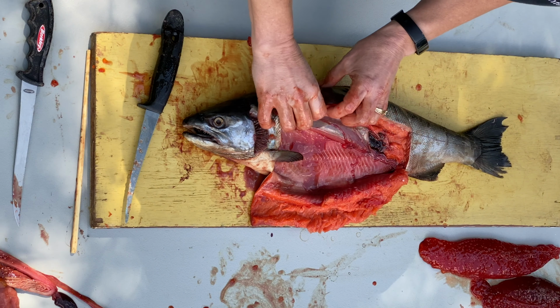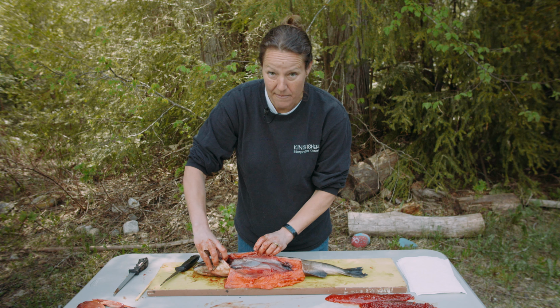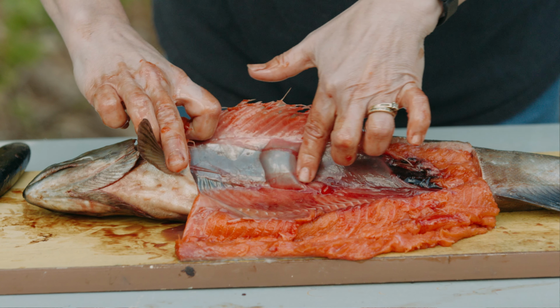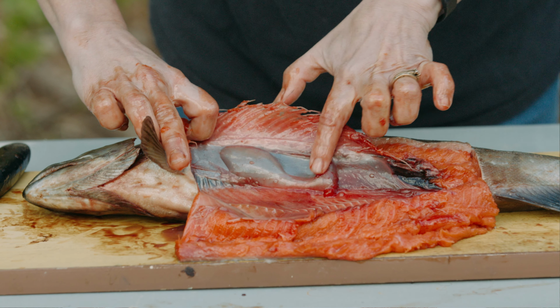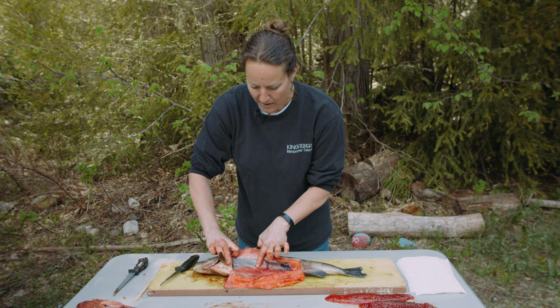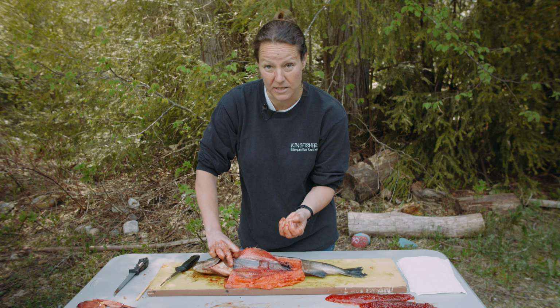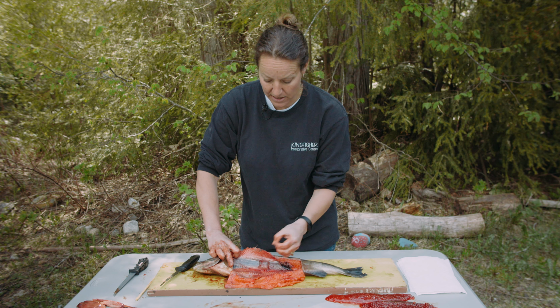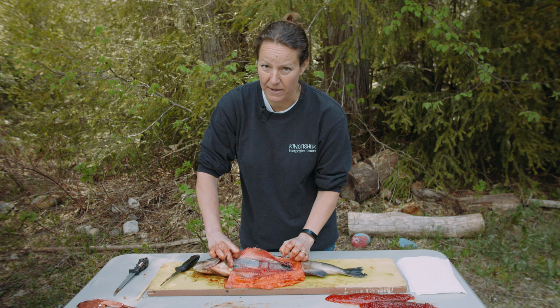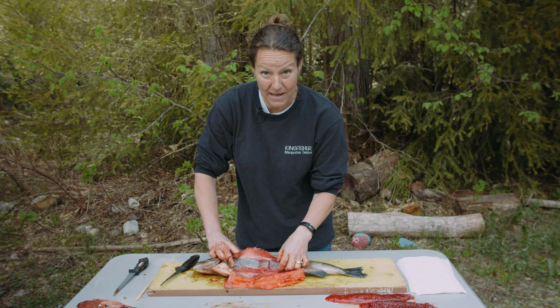Excellent. Now, what do we have left inside? It's looking pretty empty in there now, but I do see a little bit of air right here. Can you see that air going back and forth? See that air moving around? That air is stored in another important organ called the swim bladder. And usually there's much more air in that swim bladder. I must have popped this one when I cut it open. I'm still going to try and remove it, and we'll see if we can keep that little bit of air in there.